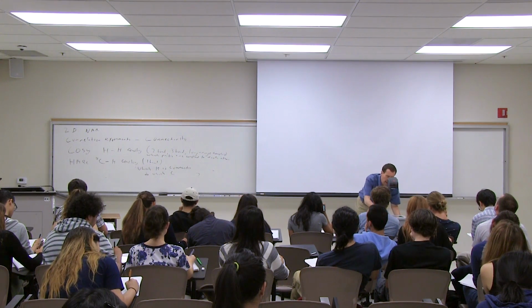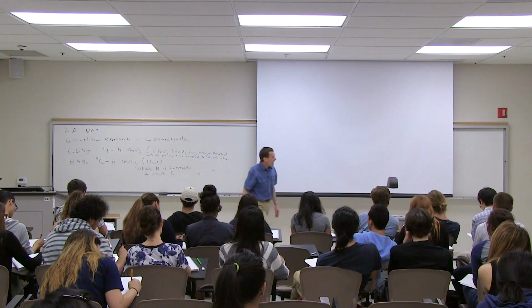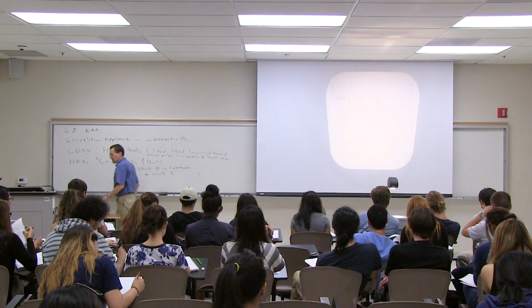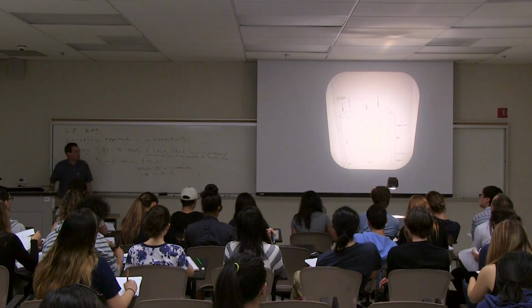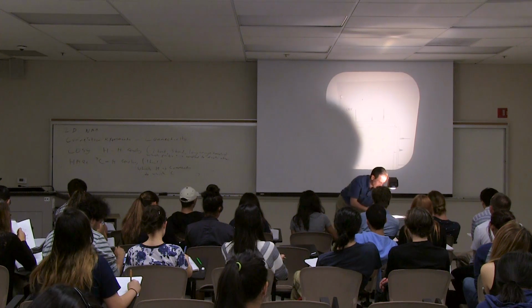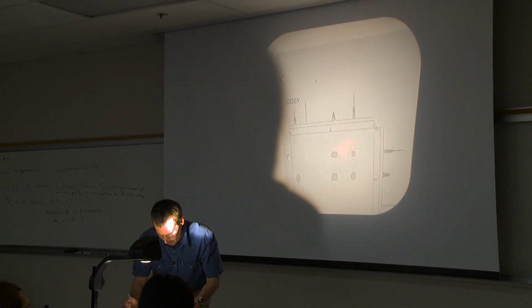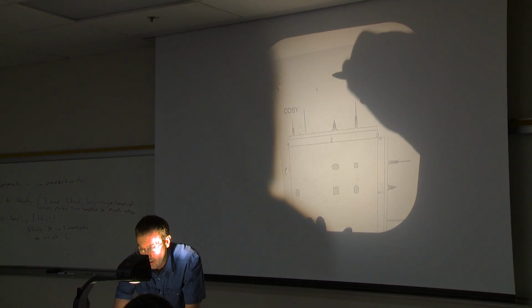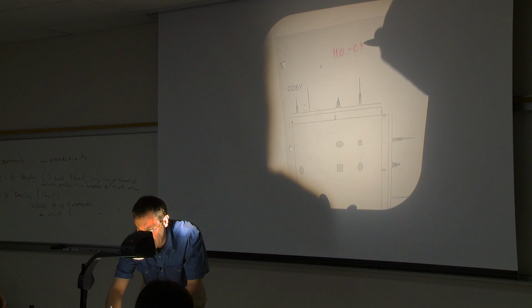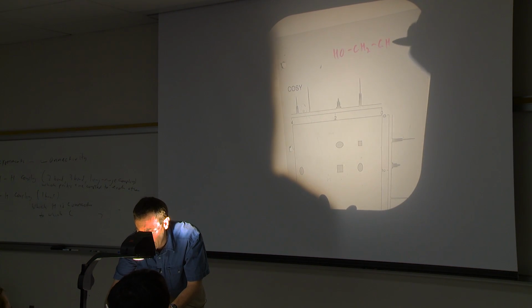All right, so by way of a gentle introduction, I wanted to give you a couple of sketches and get used to the anatomy, and then we'll look at our real example and solve a simple structure. So this is a sketch, cartoon if you will, of the COSY spectrum of propanol. Propanol is just big enough for me to make my point.